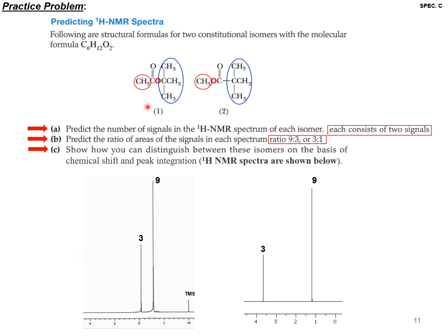Easiest way to do that is to look at the difference in the chemical shift values for the 2 peaks in each spectrum. For the t-butyls, they're roughly at the same chemical shift value. This is about 1.2, this is maybe about 1.4, not too much of a difference, but there's a very big difference in the chemical shift values of the methyls. This one is at less than 2 and this one is at greater than 3.5, so that's a very big difference.